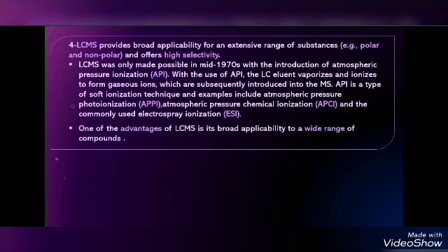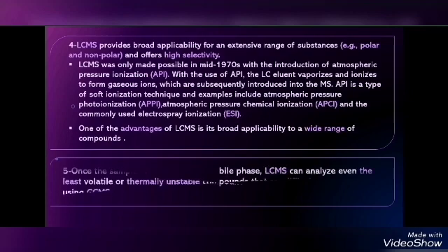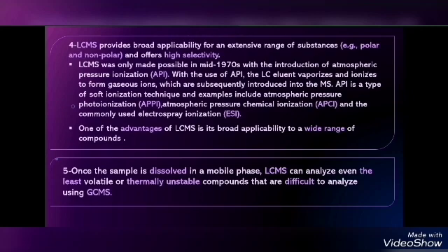One of the advantages of LCMS is its broad applicability to a wide range of compounds. Once the sample is dissolved in a mobile phase, LCMS can analyze even the least volatile or thermally unstable compounds that are difficult to analyze using GCMS.